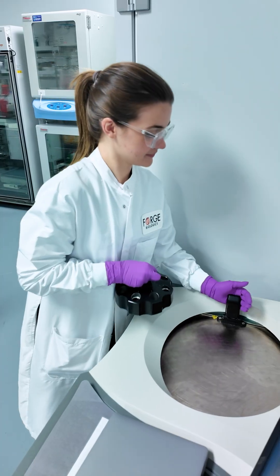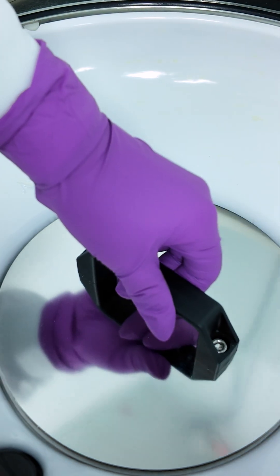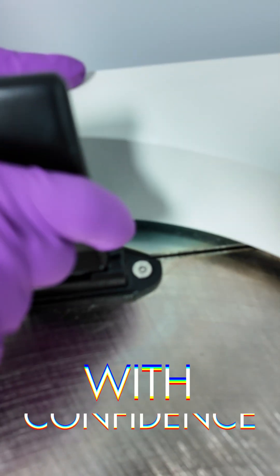These test methods are used to help our clients understand the quality and characteristics of their gene therapy programs so they can make informed decisions with confidence.